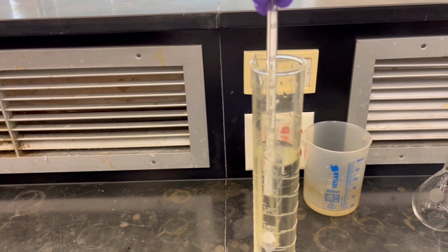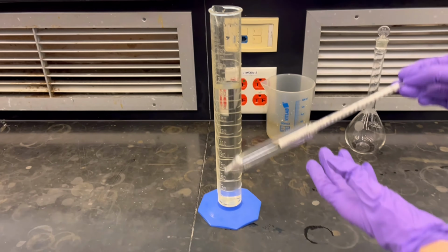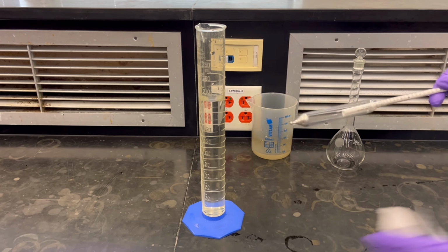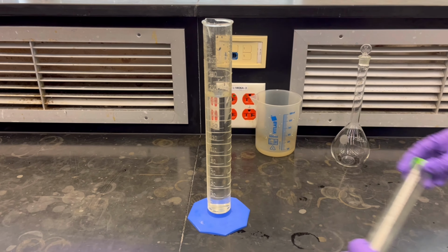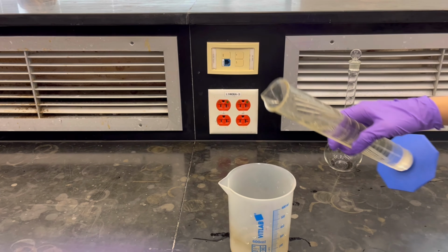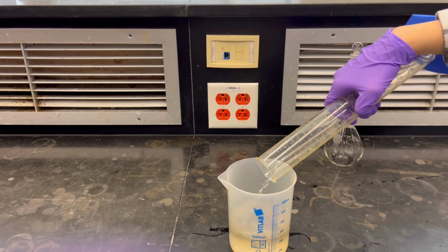After you finish the 3 solutions, you remove the hydrometer. Make sure to dry it well and wash it with DI water. After you finish with the 3 solutions, don't forget to not put the solutions in the sink. Pour them in the waste container, and they go to the non-halogenated waste.